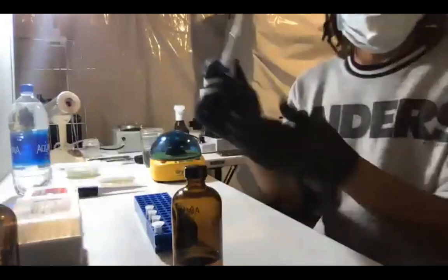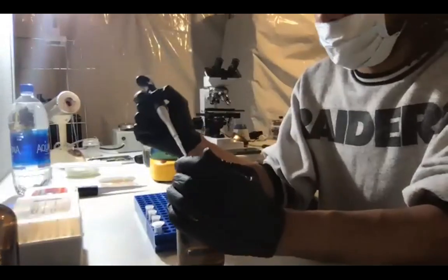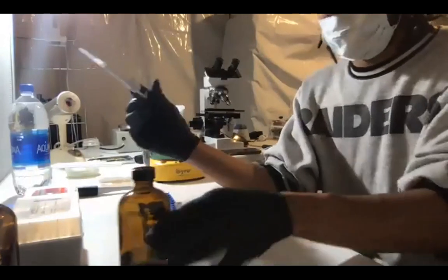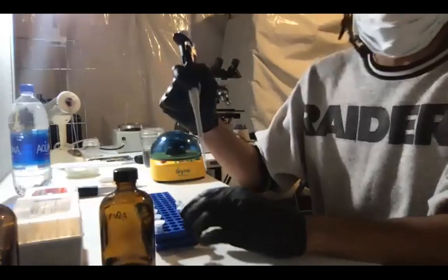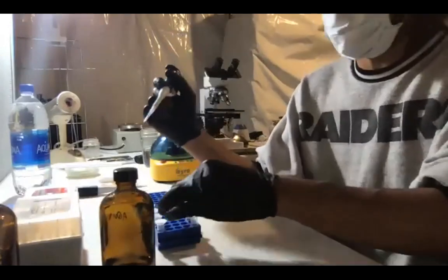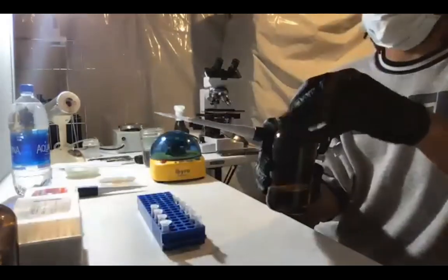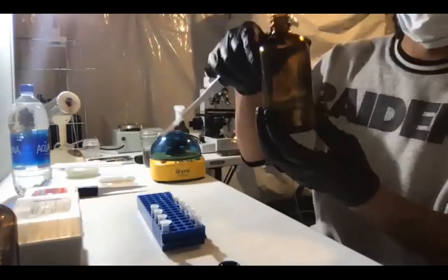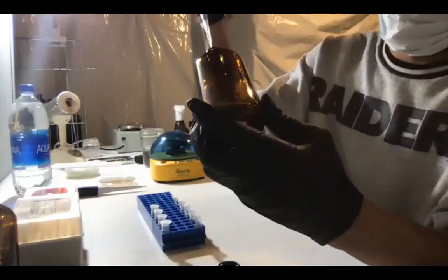The pipette tip needs to stay very clean. You don't wanna stick a dirty pipette tip into anything that you're gonna be reusing. You gotta learn a little bit of etiquette with this. Because I don't need to stick this directly into my tubes, I can use this same pipette tip for all of these tubes. So I'm gonna go in here and I'm gonna give this a light little mix and go in here.